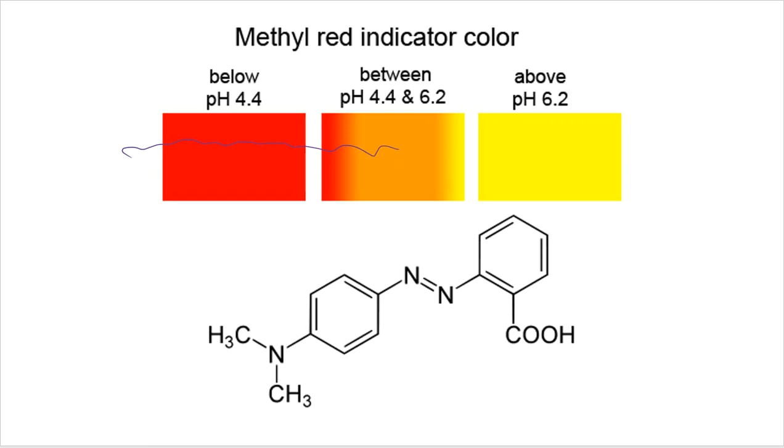And the reason is because those acidic conditions will make my precipitate fall apart. I will not get a precipitate. So I need something on the basic side. So it's going to say add ammonia until the color changes. So what we're expecting to see here is something more on the yellow side.